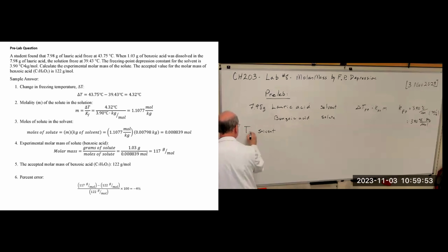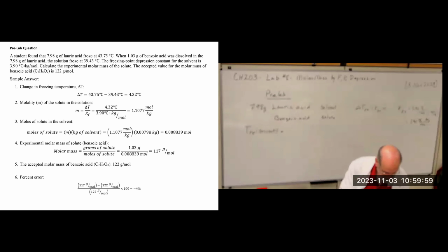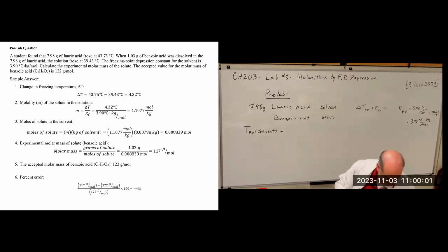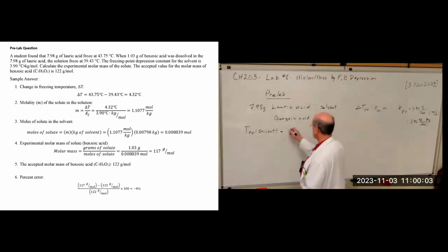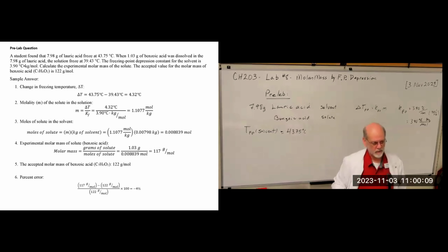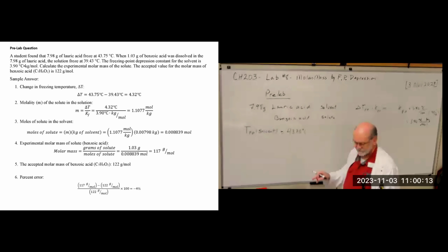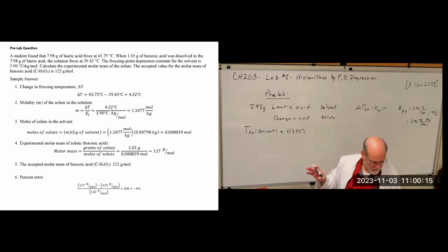Temperature, the freezing point of the solvent is equal to 43.75 degrees. So they've got better thermometers than we do. It's probably digital. Okay, that's the solvent.